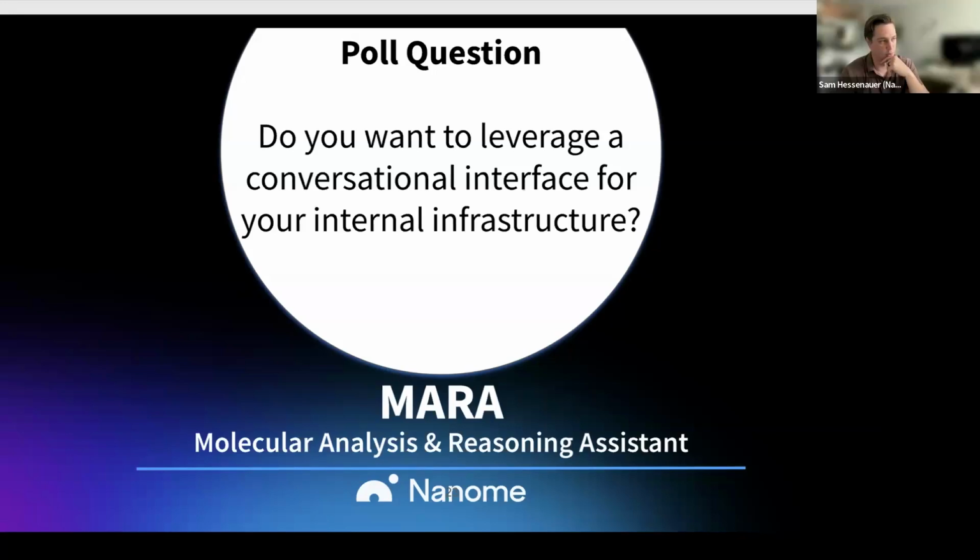Yeah, we also, with Python tools, with enterprise customers, we expose the Docker file. So if you want to install CUDA and do more advanced Python tools, you can. So a lot of the really heavy compute type of things that you'd want to do, or long running or infinite tool use, those things are very much oriented for enterprise customers. So this is very much, as Quillon mentioned before, just a taste of what the platform is like, and to get the concepts. But ultimately, this is an enterprise product.